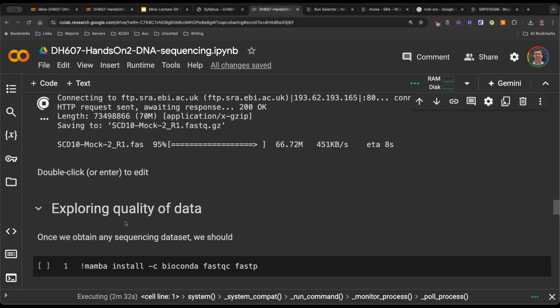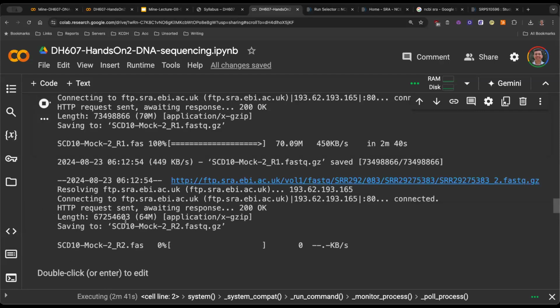When you make this shear, that's when your insert size is determined. At that step, you ideally want to make inserts which are of similar length. So if you were to plot the histogram, I could take all these fragments and plot the histogram of their lengths. And the peak that you get, that's your insert size.